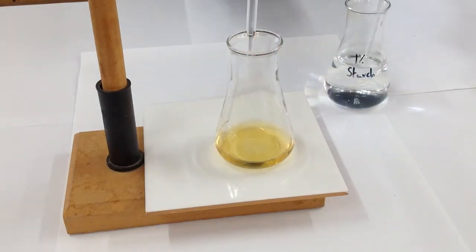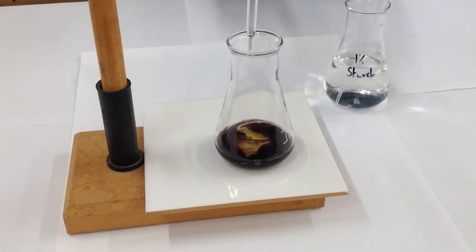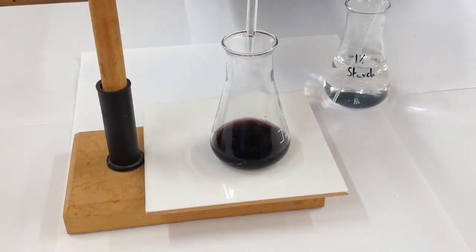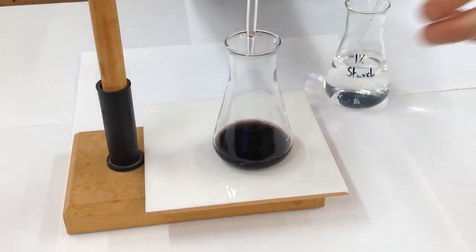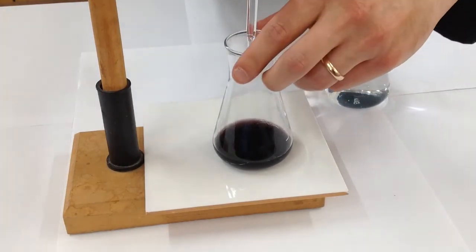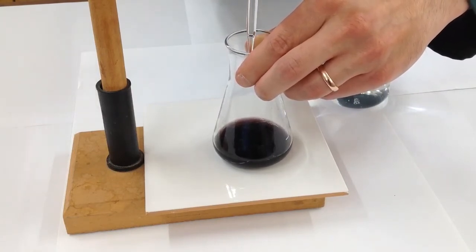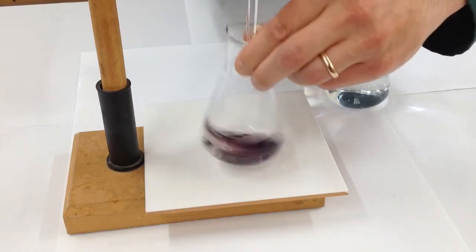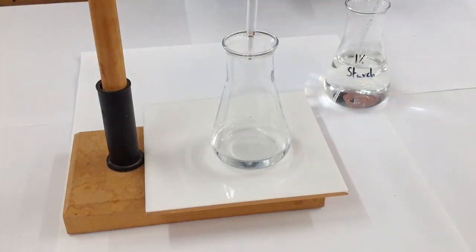Now if we've overshot, the starch won't go a blue-black colour. We had about 1 centimetre cubed of starch from a pipette, and we've still got plenty of iodine there. You can see, just give that a swirl. So now what I'm going to do is just set the burette to add this dropwise. Now if you were doing this in real titration mode, you'd add 1 drop at a time, but I want to just show you what the colour change looks like by adding dropwise. You can see still the blue-black colour, and you should be able to see, just in one drop, it's gone to completely colourless.